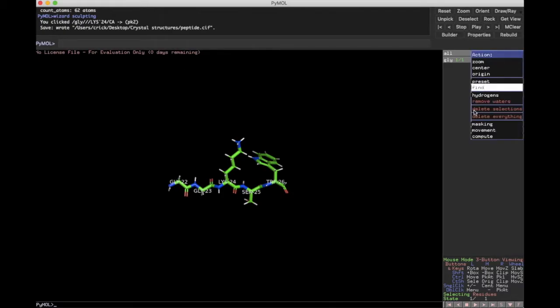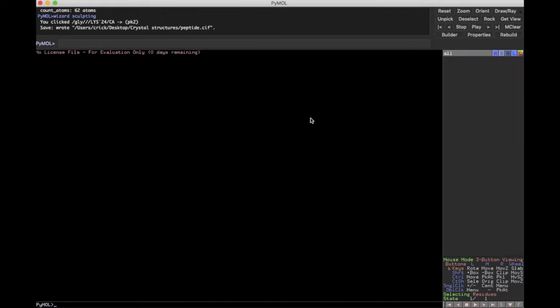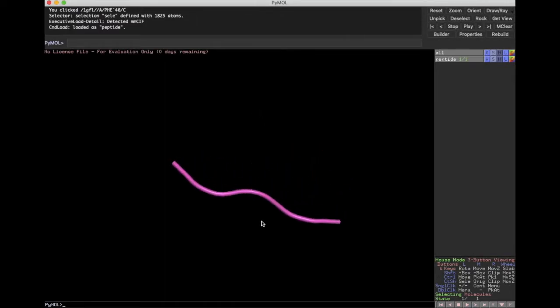I'm going to delete everything. In this video, before we get into linking this to other proteins and whatnot, I want to start by talking a little bit more about the sculpting feature, for example. So the computer has these algorithms which guide the twisting and the turning and the movement of the atoms, but I want to talk a little bit more about that, just so we understand, for example, bond angles and whatnot in the backbone especially of amino acids and proteins.